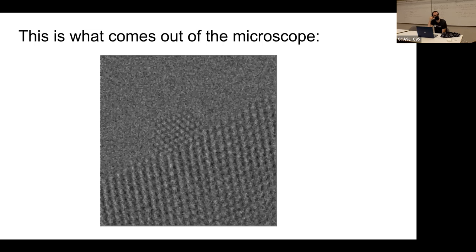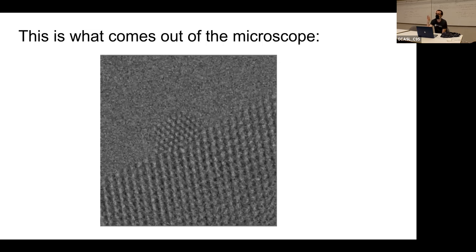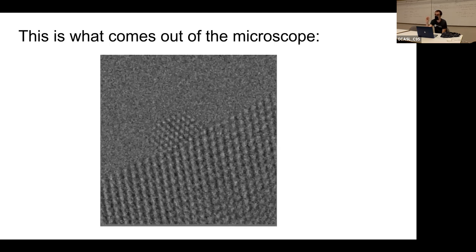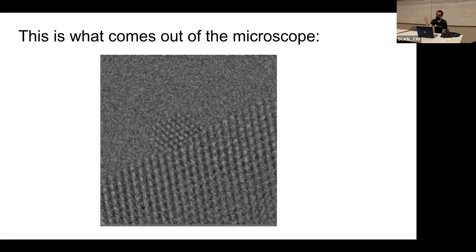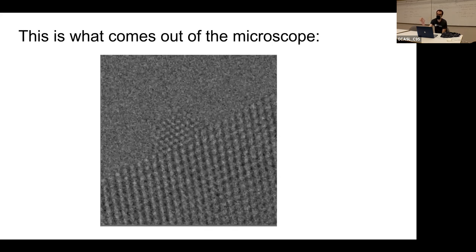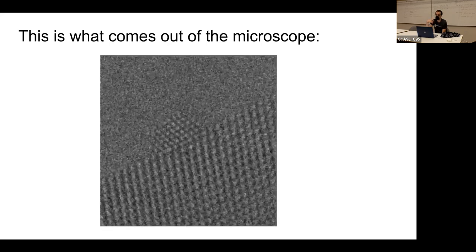It's basically that. The problem is that you cannot send too many electrons in. Maybe the analogy would be when you have a camera in very low light, so there are not many photons coming in, then there's much more noise. As opposed to when it's super bright, then there's going to be much less noise. And that's a good question.